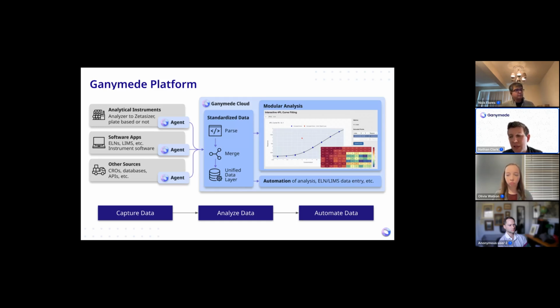It's not having it be something that runs silently in the back end as a magic wand, as much as something that is actually at users' fingertips in the application, being in this human in the loop step of being in the app where we can partially fill out analysis for humans with AI or even fully automate it, makes it much more of a conversation with the data, which is what's needed to really leverage AI.